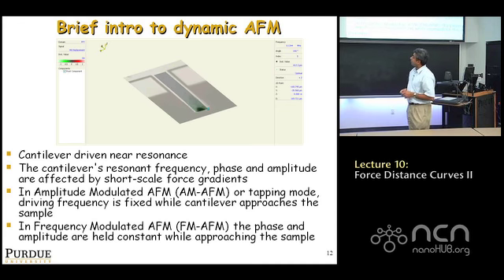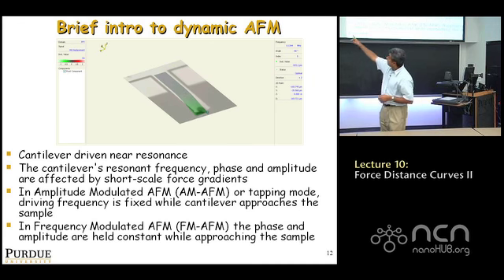Now, this is a dynamically evolving shape. It's going up and down, changing with time. However, you can show that the temporal motion is basically a sine wave, but the shape just evolves up and down. But although the shape looks very much like what you might expect when you apply the point force at the end, it is not described by a cubic polynomial.